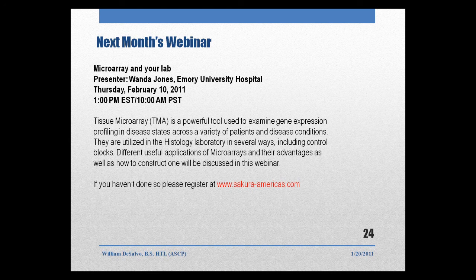The internet is always a great resource. And then there are very many other webinars and seminars that you can take through the state societies, NSH, and again through such as Socorro. But before you set your quality planning, you need to set what method you're going to try to follow, and then get directed specific resources on that method.